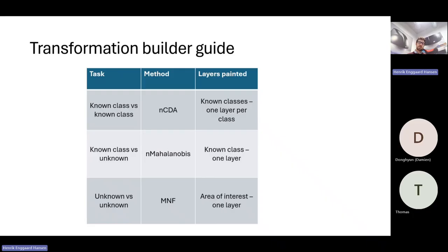And finally, we have unknown versus unknown cases, where you don't know what you're looking for, but you want to explore or look for new options. MNF is the tool of choice. It allows you to highlight areas of interest and explore without any filtering.